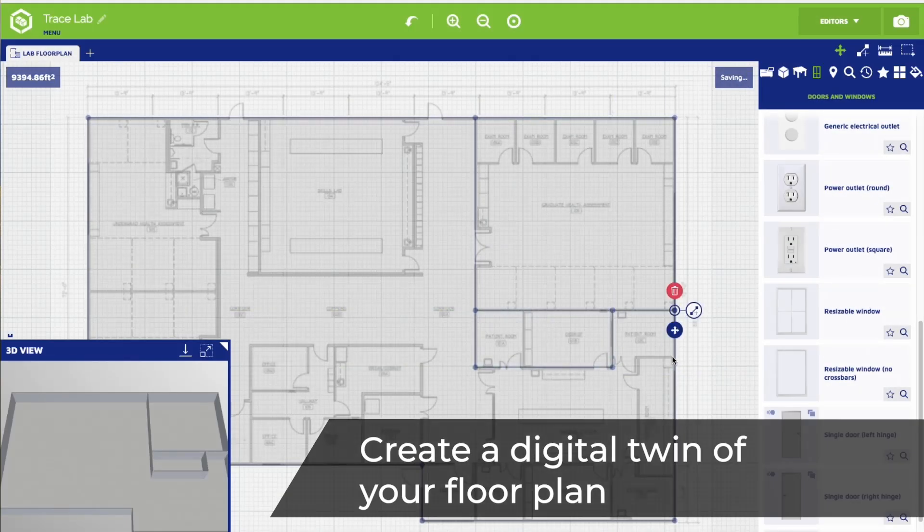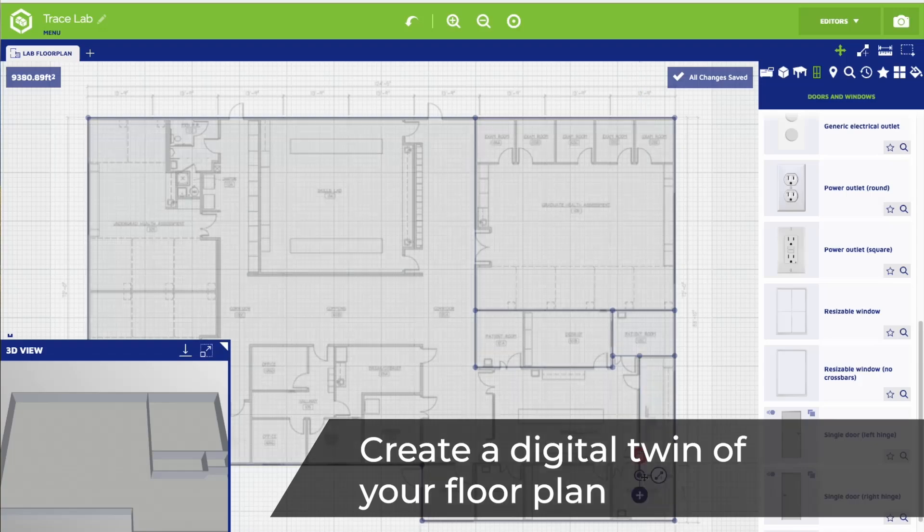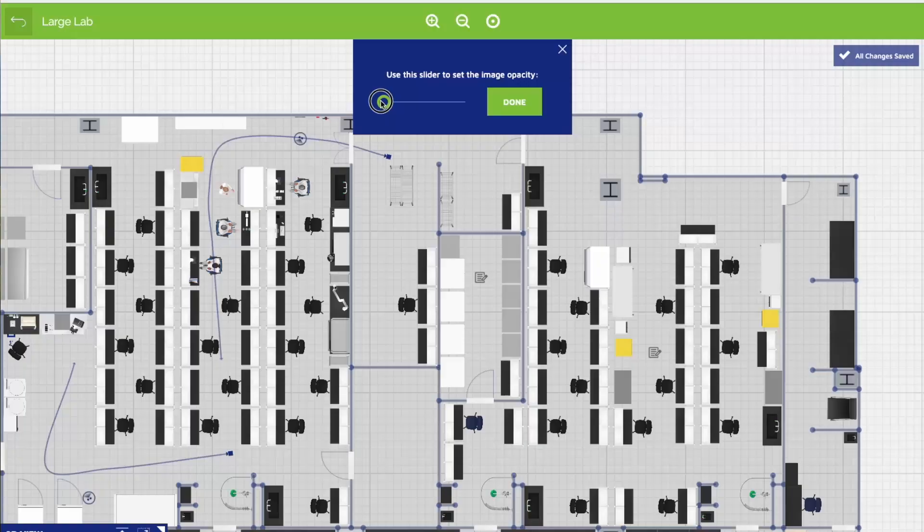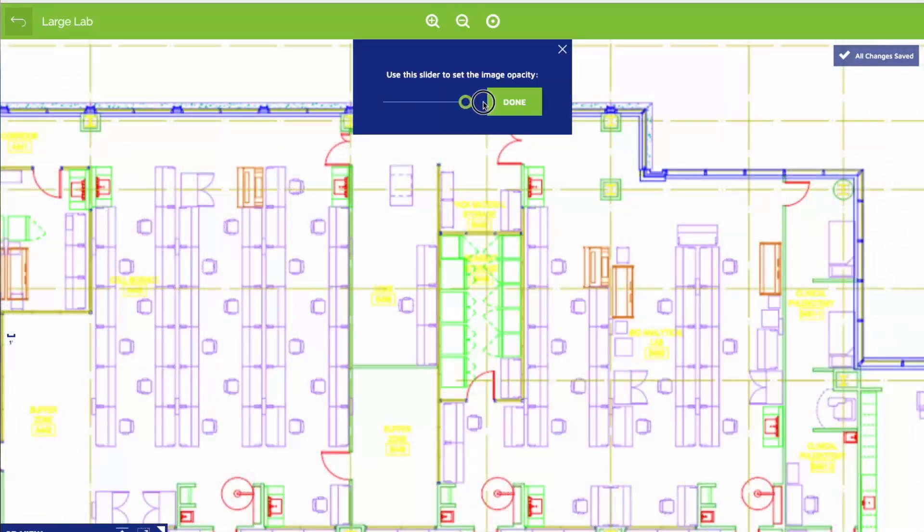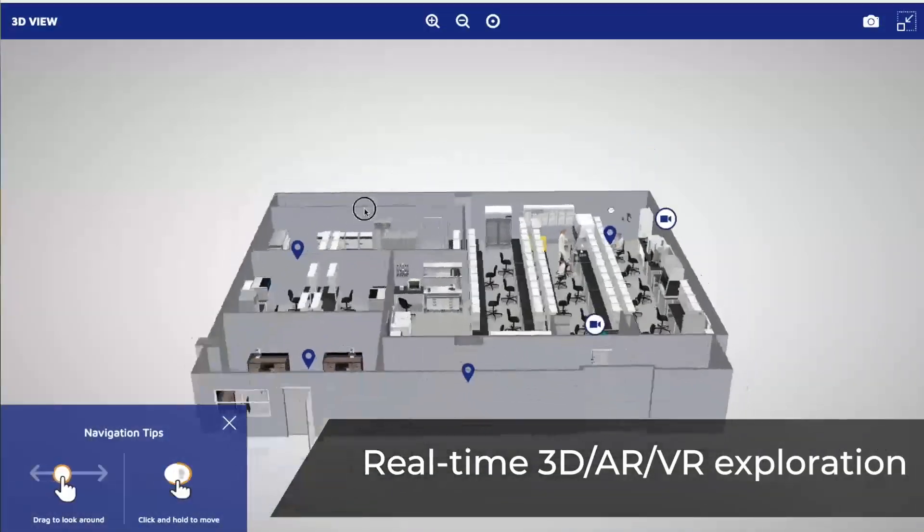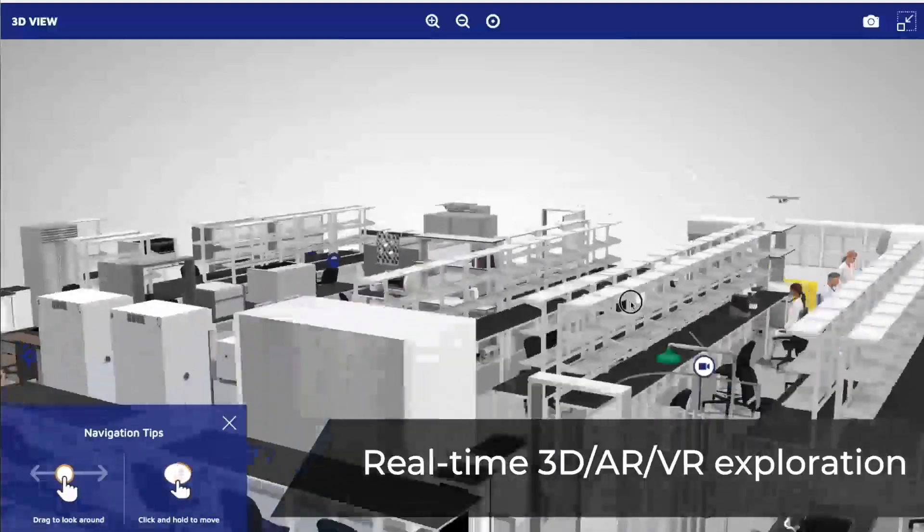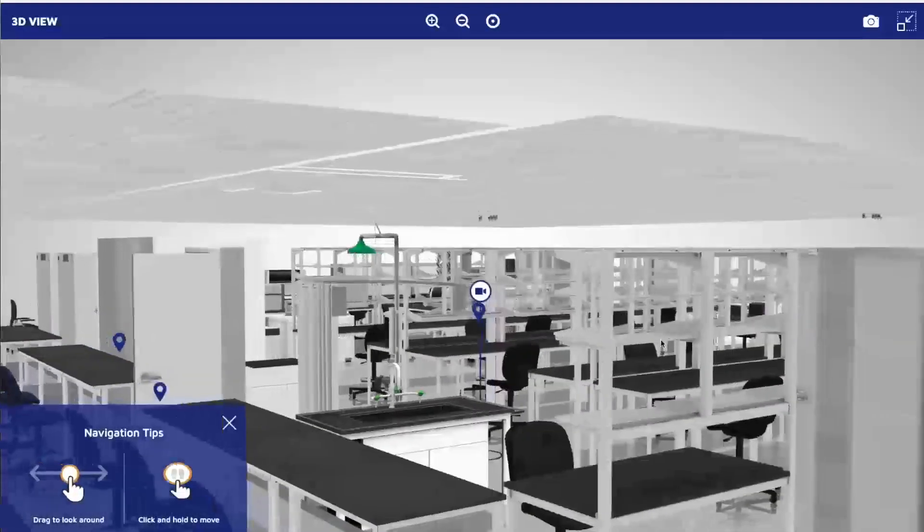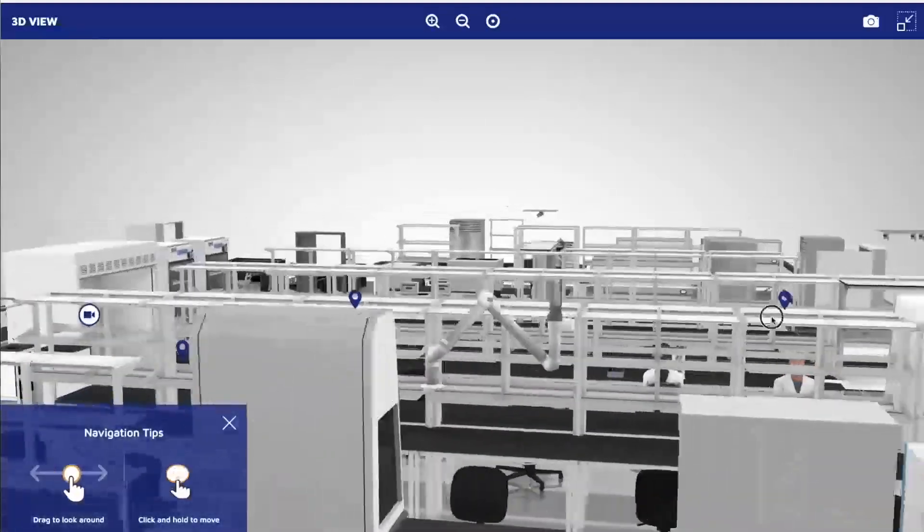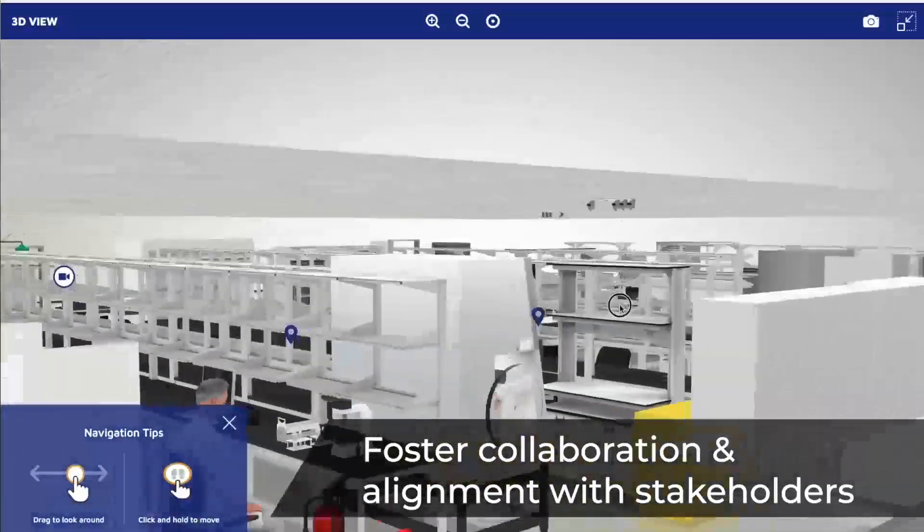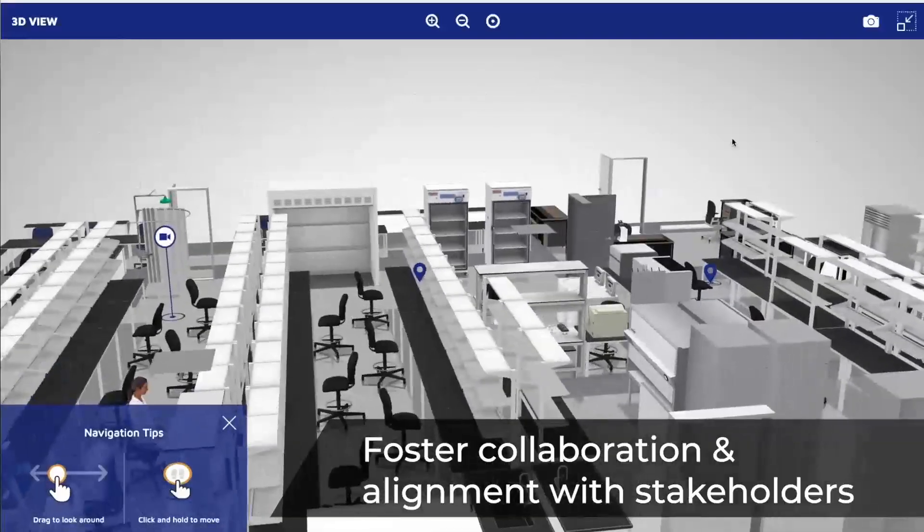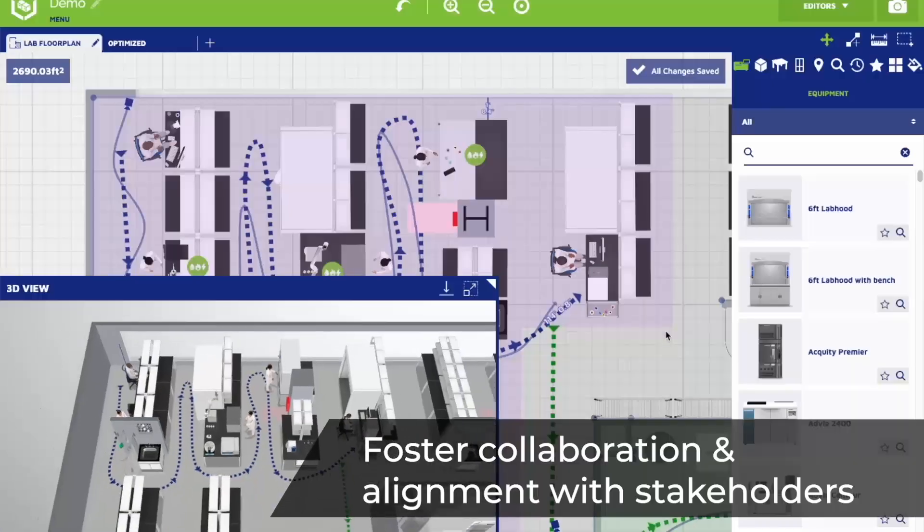Bring your lab to life with a real-time digital twin. Plan with precision before making changes. Design for scientists, not just designers - effortless and intuitive to use. Explore your lab in real-time, align teams instantly.